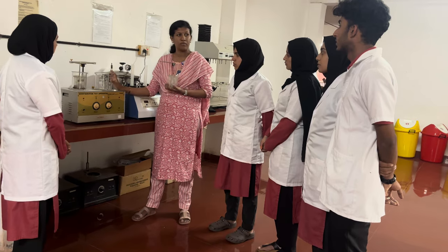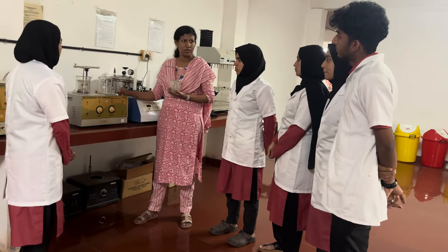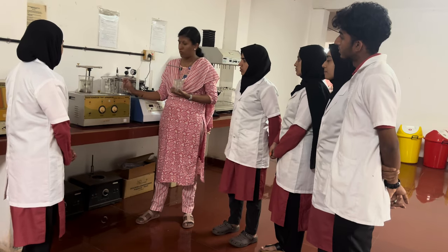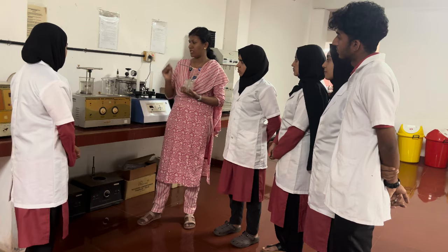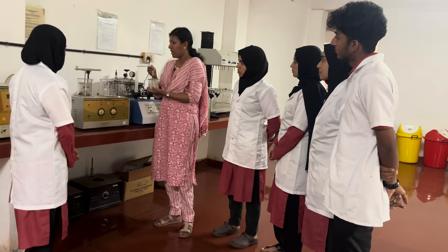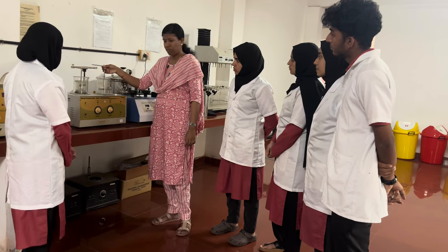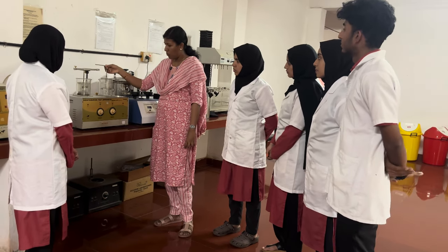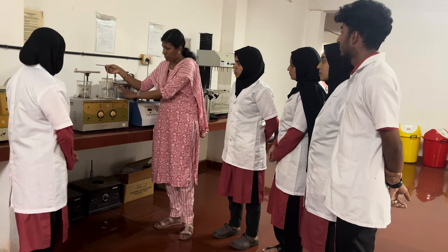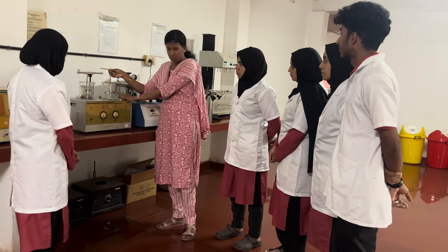How much? Why can we take 500 or 600? Why are we not taking 1 liter? How do you know how much has to be filled in this beaker? There is a specification given in the Indian Pharmacopoeia. During the operation, this basket rack will have an upward and downward movement, right? So on the upward movement, how much will it travel? The tablet will be in this mesh.